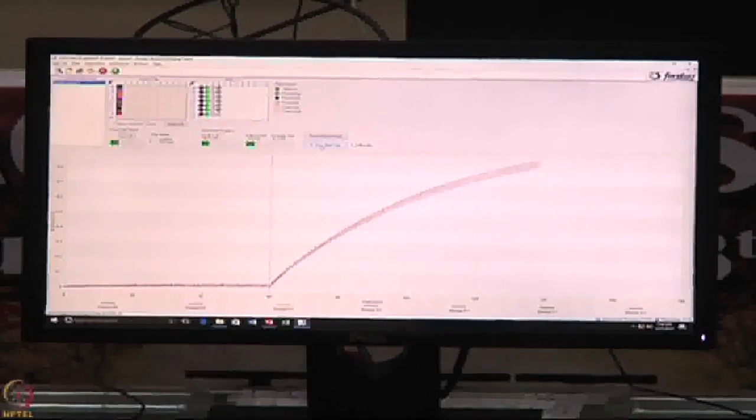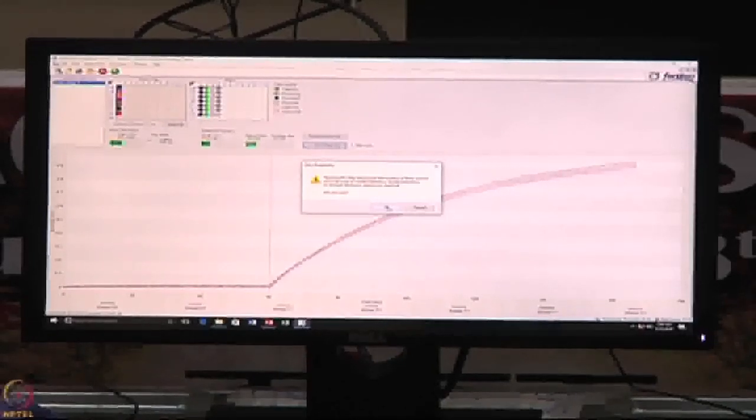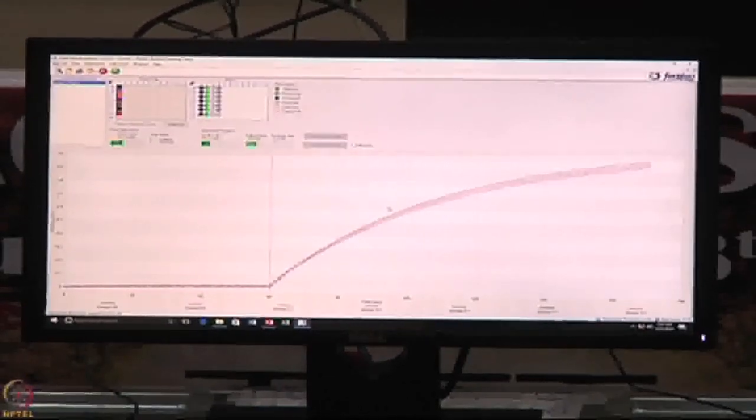From 10 picomolar to 1 millimolar, you can go. That is broad, on par with your Biacore. So around this is good enough for me, I think. Loading, one nanometer. Okay, fine. I'm going to the next step. It's good enough for me, the immobilization level.